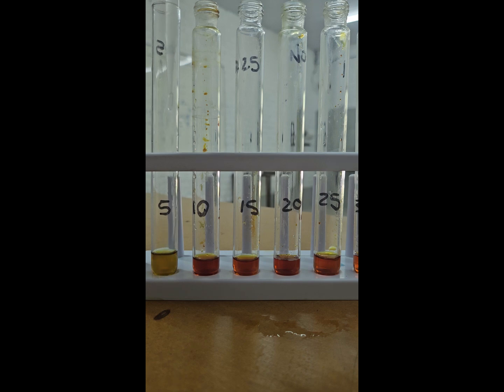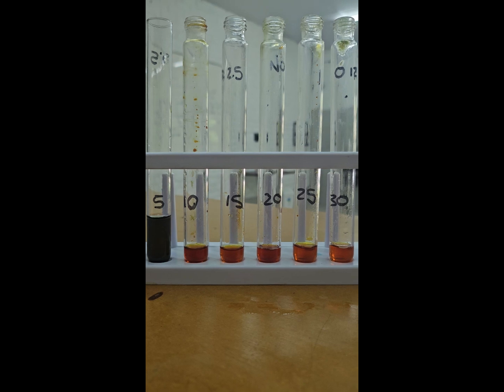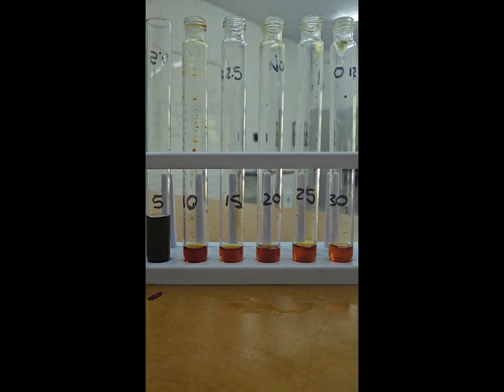Now after 5 minutes has passed, I will add my starch solution to my test tube and then look at the results. Here I can see that my starch solution at 5 minutes still turns my iodine blue-black, meaning that there's still a lot of starch present in my solution.